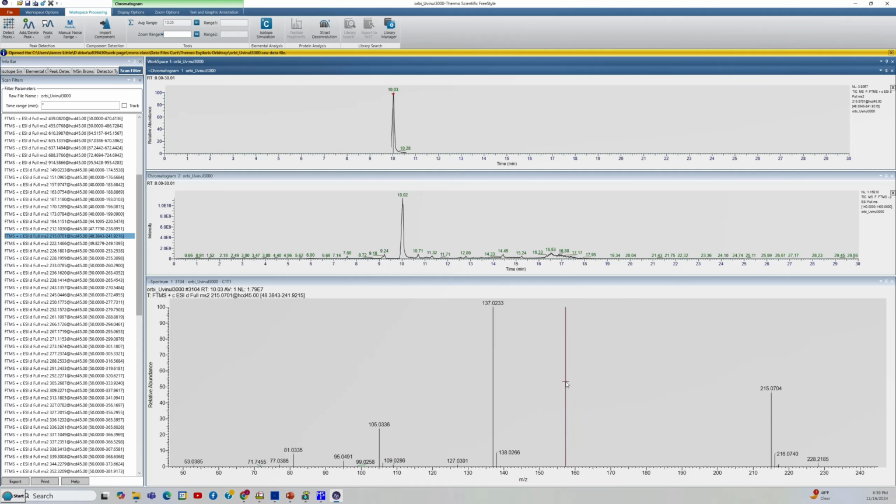So these are two alternate ways, one in which you go in and parse out the information into two windows and look at it and make sure it aligns up with your diode array. And the other way is if you just walk through it, which is, I don't think, very useful. But if you just got one peak, you could just keep stepping through it and see it goes from one ion to another. Then it does the automated targeted MSMS and will show it in the next scan.